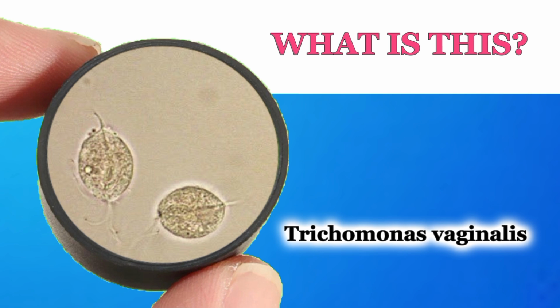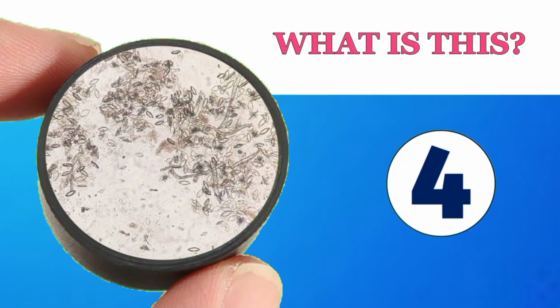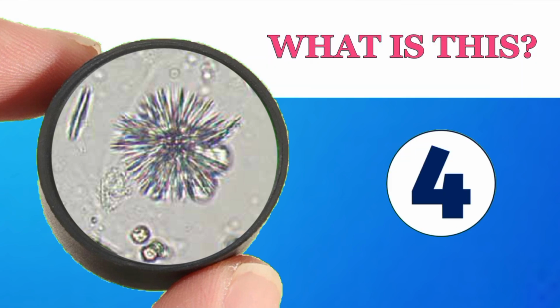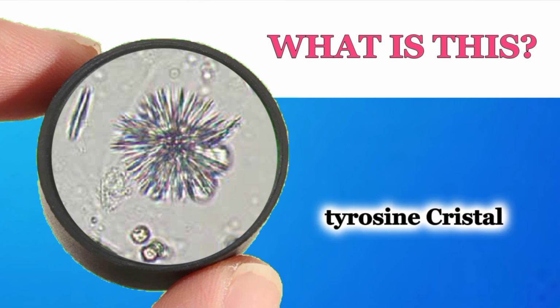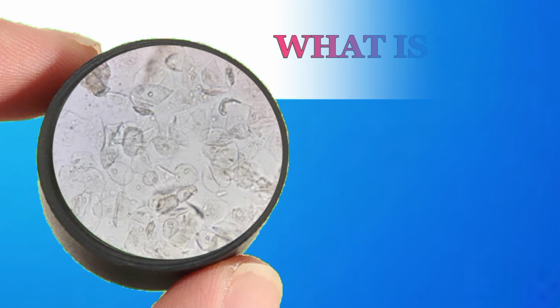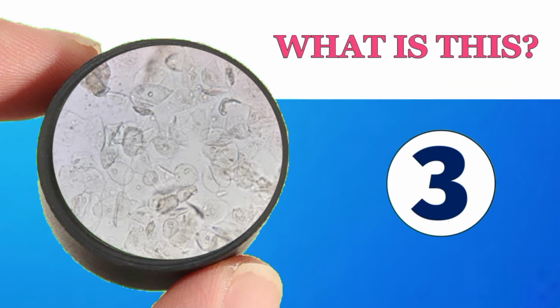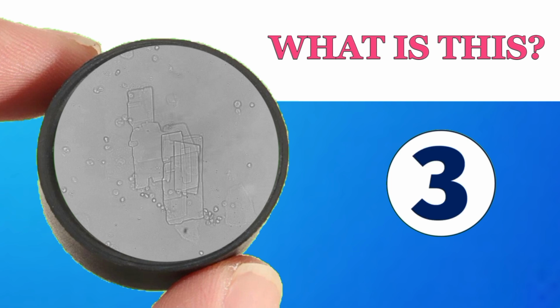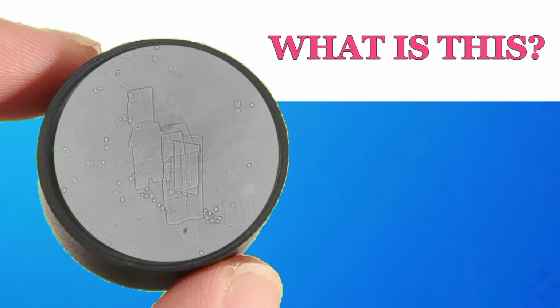Trichomonas vaginalis, amorphous phosphate, tyrosine crystal, leucine crystal, epithelial cell, cholesterol crystal.